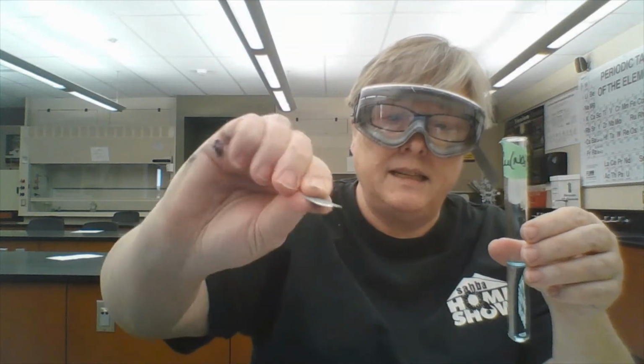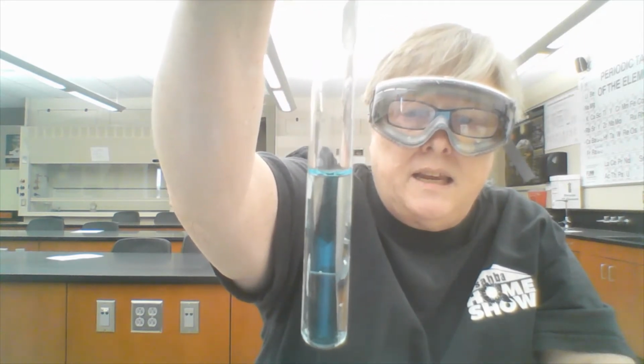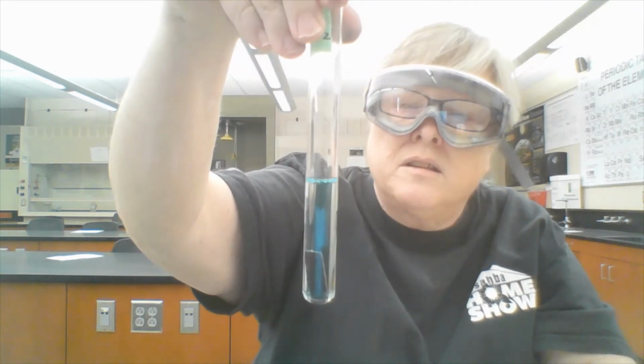Now I'm working on test tube number 2, copper 2 nitrate, with a nice shiny lead strip put in. Let's see what happens. The lead again immediately went dark. It looks like there's mold growing on it or something. So I would call that a positive reaction. And you can see even better now how the silver is depositing on that first lead strip in the silver nitrate and lead together.